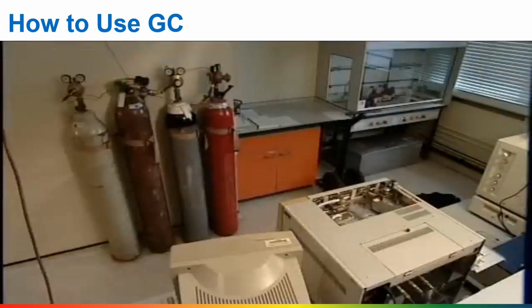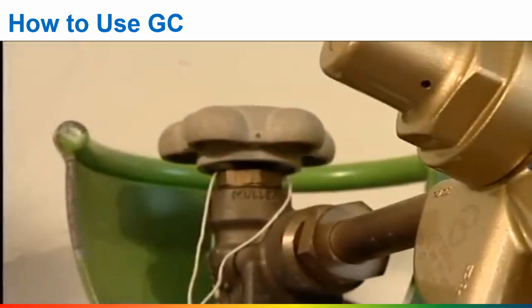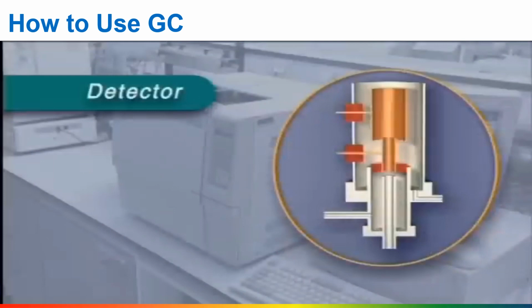The components of the mixture are carried through the column by a stream of inert helium gas, the mobile phase. The more volatile the component, and the less it interacts with the stationary phase, the faster it travels through the column. At the other end of the column is a detector that detects each component of the mixture as it comes out of the column, and also measures its amount.